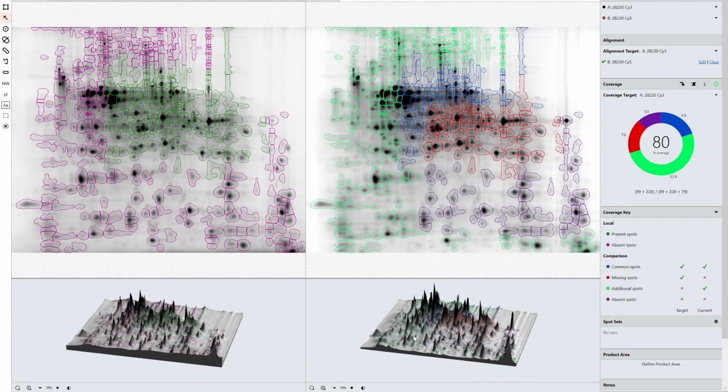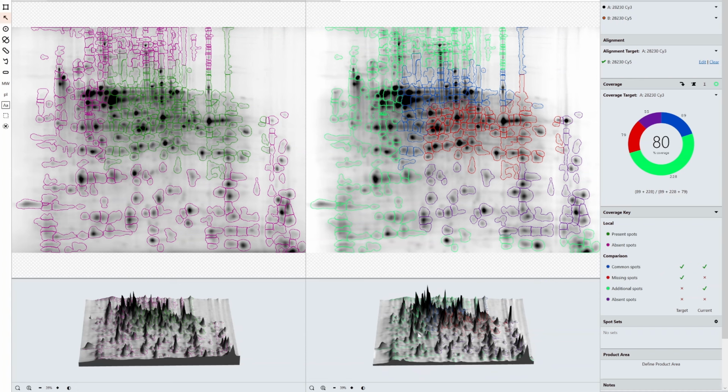If we want to get the 3D view out, what we can do is right click and go on Add to Data Access. Now this takes me to the second method we have for exporting our images. Data Access is a bit more full featured than the copy to clipboard option. So if I click on Add to Data Access and give it a name, I'll just call it 3D View for now. That will then allow me to find it later on within the Data Access tool.